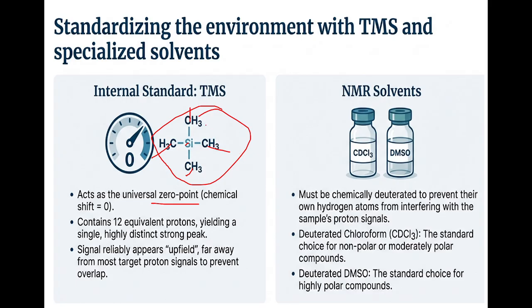Because look, this is the maximum hydrogen involved. There are 3, 4 times, that's 12 hydrogens, and these 12 hydrogens are all equal, one environment. So we get the longest signal, for 12 hydrogens.